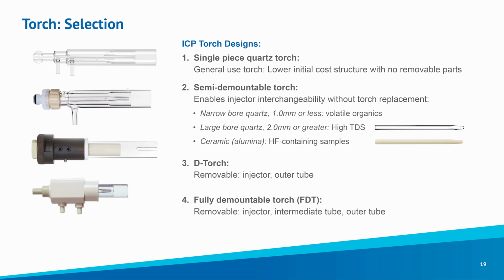be disassembled. First, there is the single-piece quartz torch. This is a general option with a lower initial cost, but if any part gets damaged, you have to replace the whole torch, and it lacks versatility.